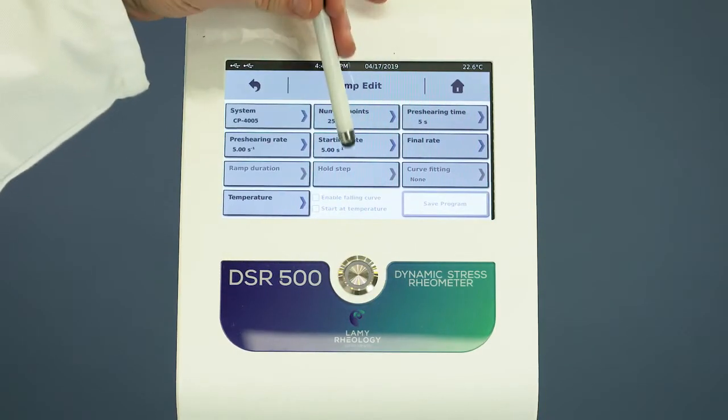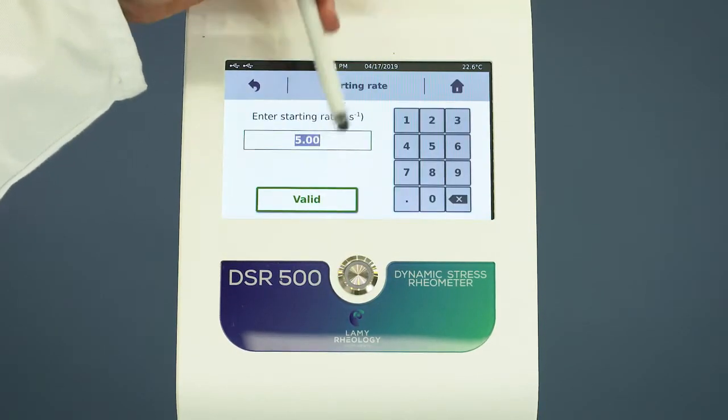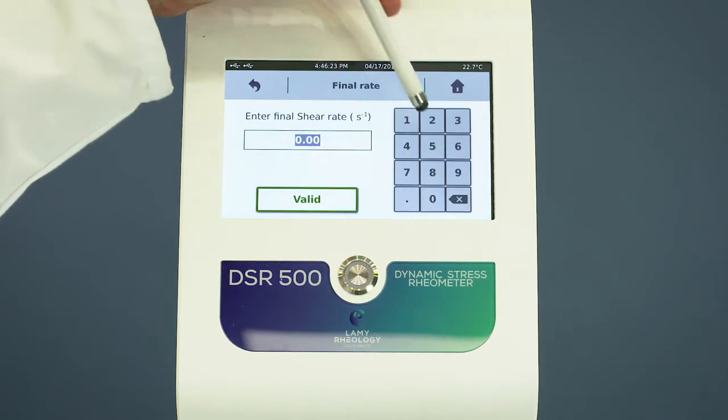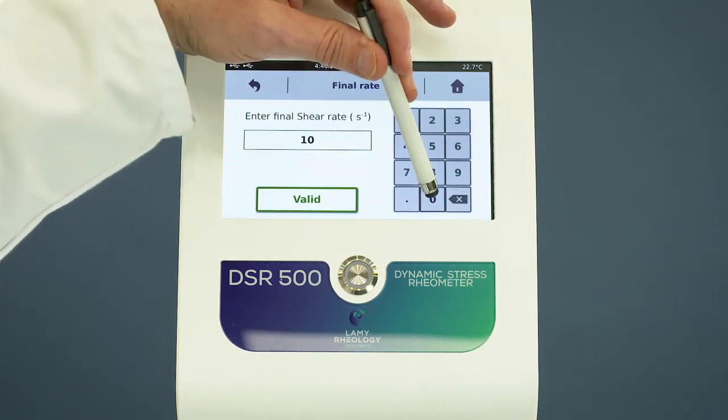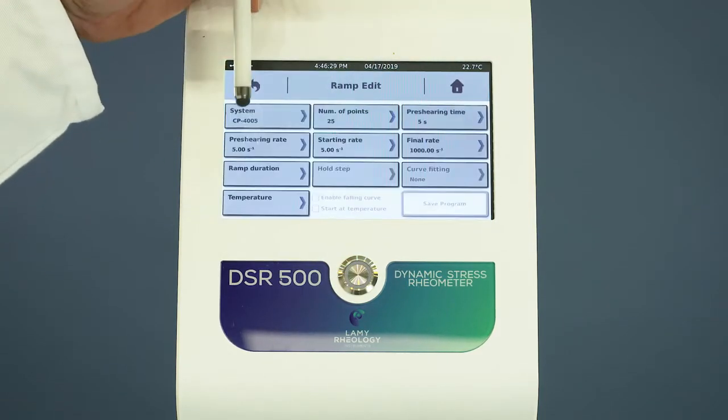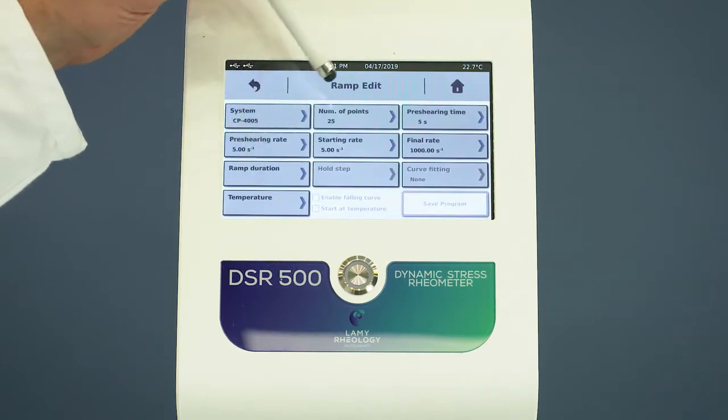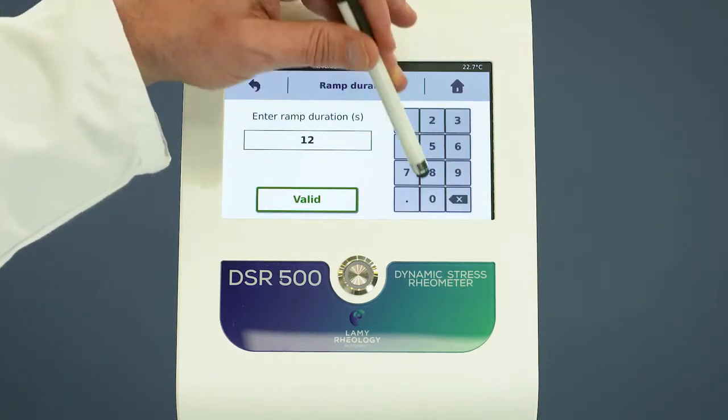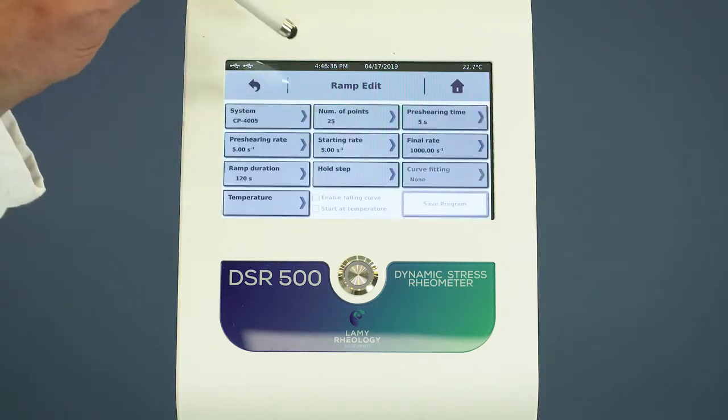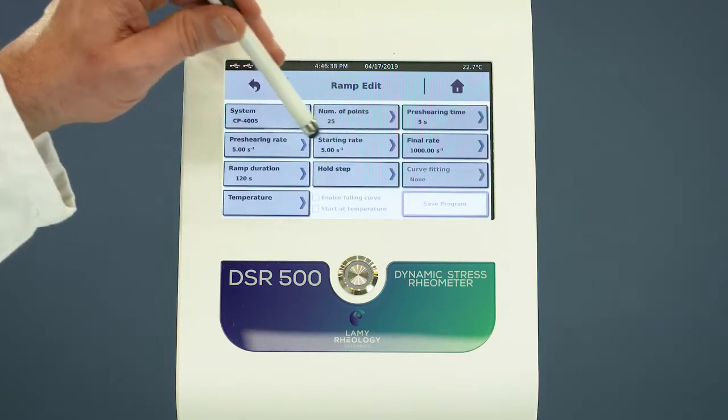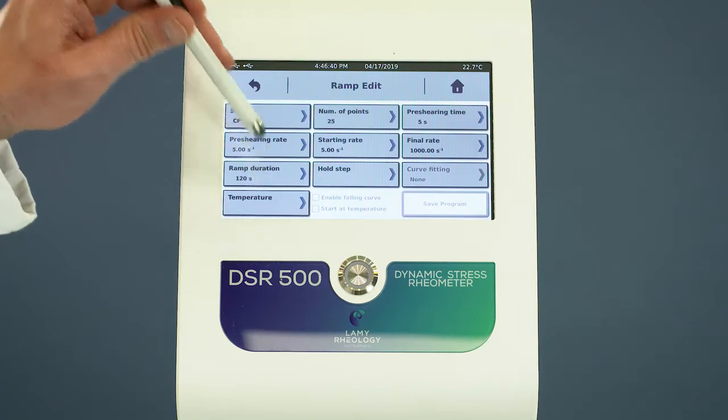Set the initial and final shear rate. Set the duration of the increasing and decreasing round. Set the temperature.